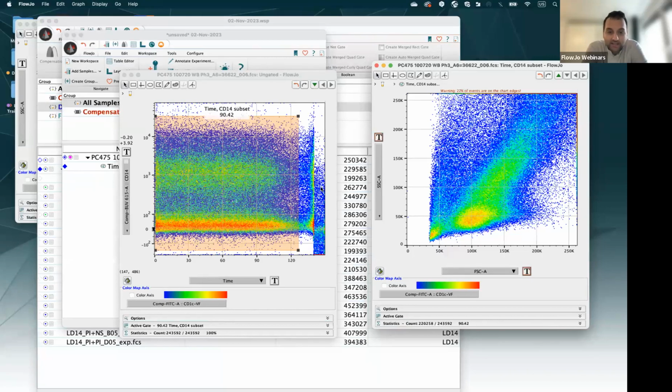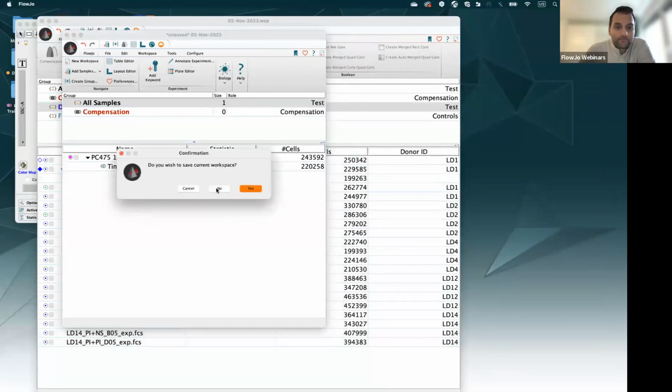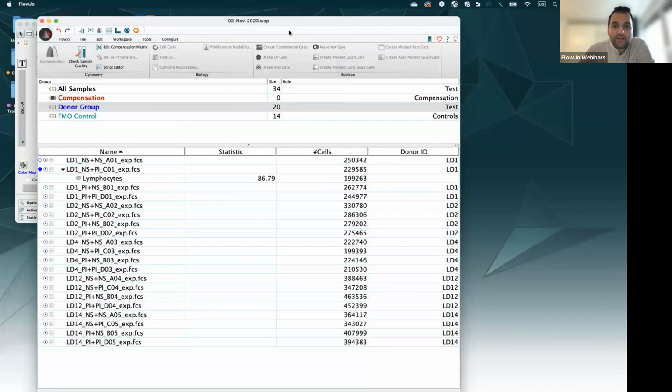And I really suggest that you follow, especially in the Europe time zone, Serena, my colleague that is here, will have a webinar on the advanced tools, and she will show how you can automatically and in an unsupervised way filter and exclude anomalies and bad events from your data set. I hope this answered your question. You're very welcome.